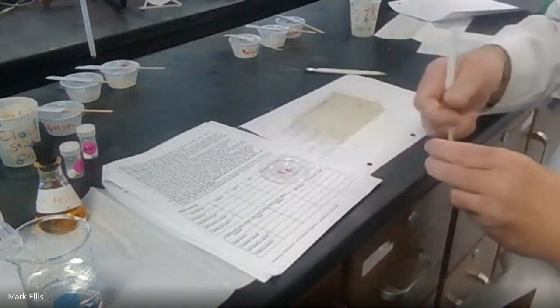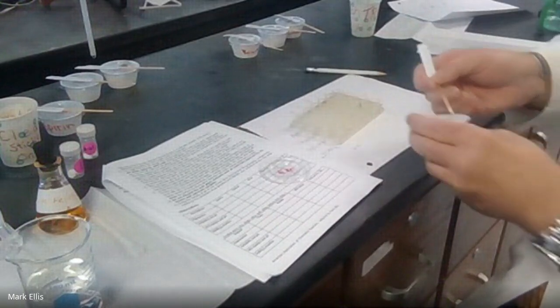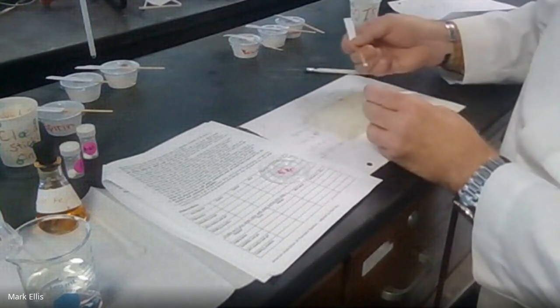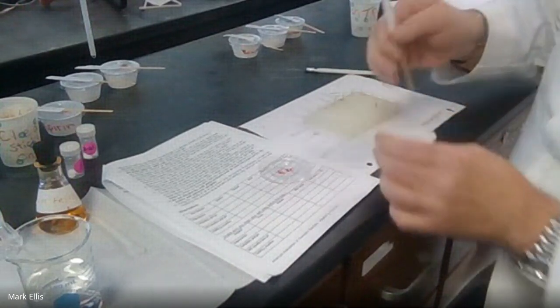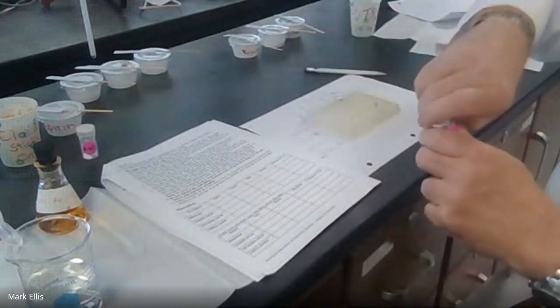Put a little bit of Excedrin in each of the wells of the fourth column, just a teeny tiny little bit. We just want to do a little bit because we're going to add just a little bit of these solutions. If you have too much of the solid in there, it won't work.